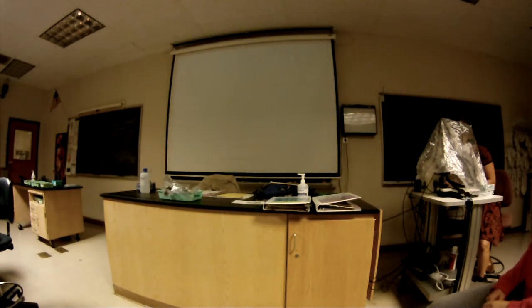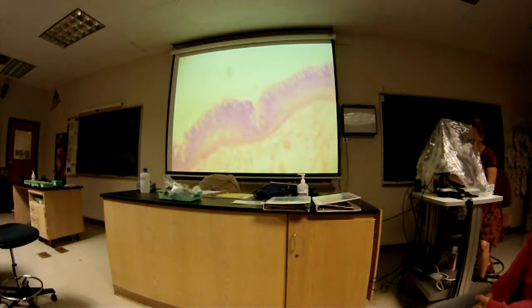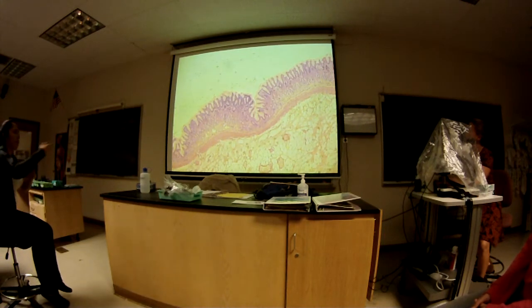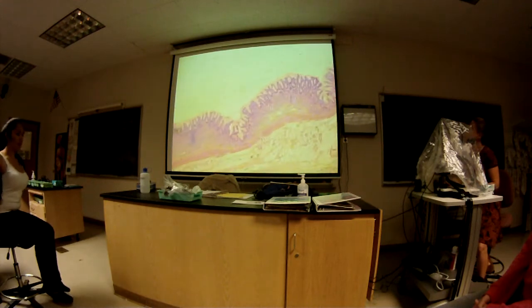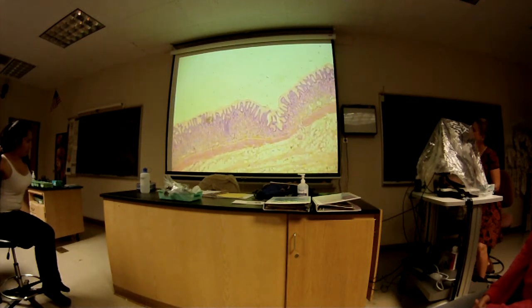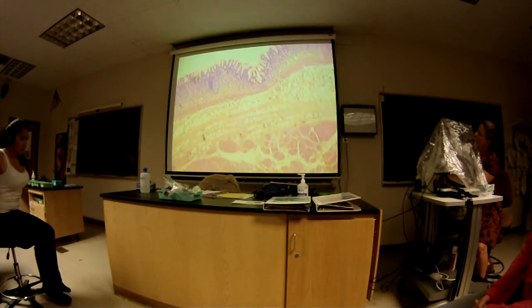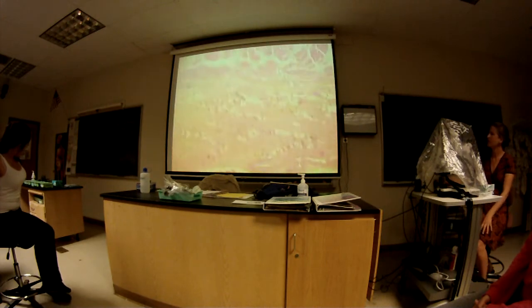Esophagus, and the esophagus is going to have the main layers.